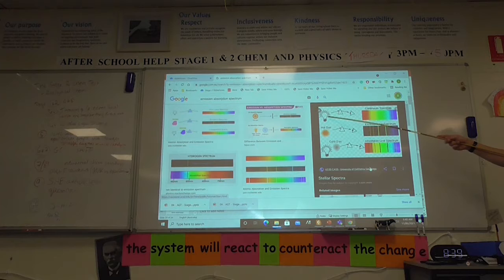So here, hot gas, and you put it through a tube, then you get a continuous spectrum. This is hot gas in the, wait. That's an incandescent light bulb. That's the one that vibrates the little piece of tungsten which has atoms vibrating at a bell curve range of different temperatures, which releases a continuous spectrum of light, including beyond and before the visible light in the spectrum.